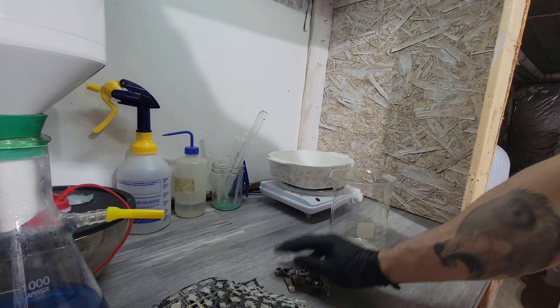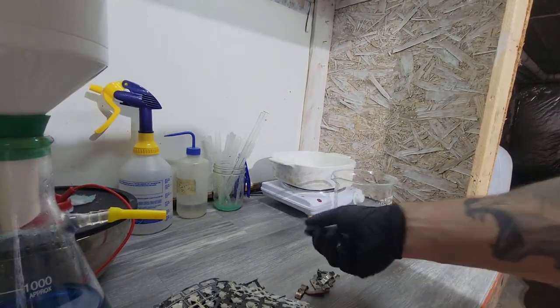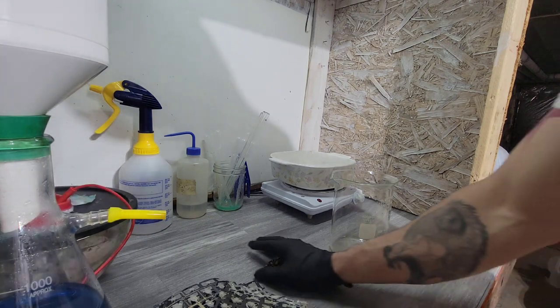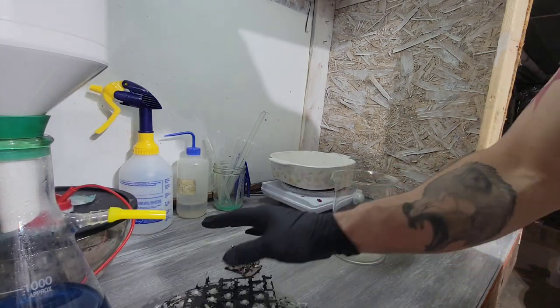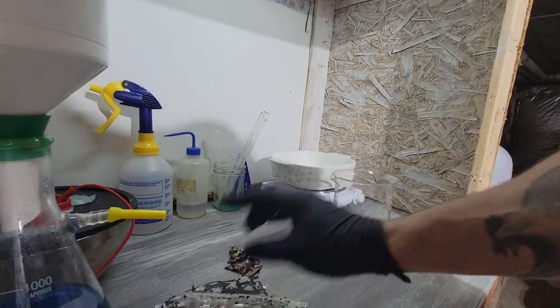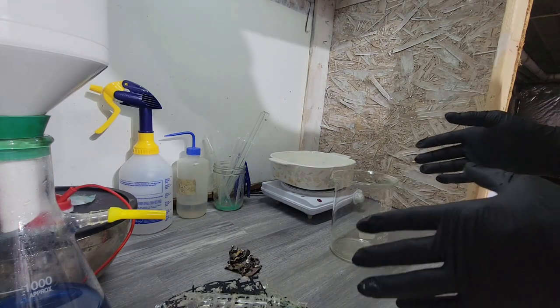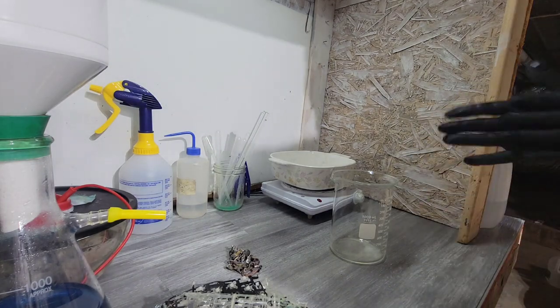And then I've got some silver coated copper that I will introduce after to make sure that we utilized all the nitric. There's some, I think, hydrochloric acid that got on these, so we're going to see some silver chloride form right off the bat.